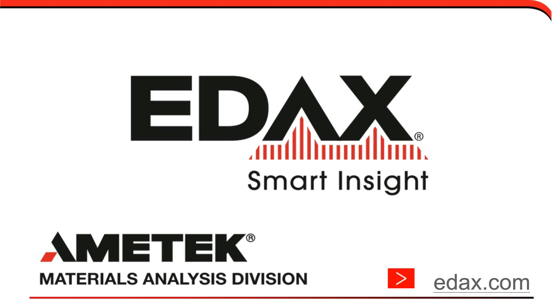It has come back as a note that there was an attendee today that mentions that they actually used the PRIAS imaging in transmission mode on atom probe tips. So you could use that to determine where the grains were, to give an additional imaging technique for locating where the grains and phases are in atom probe tips by using transmission mode.